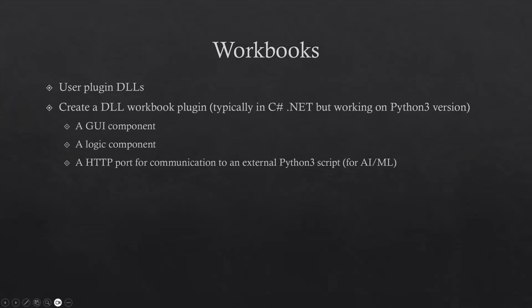The previous two approaches are extremely powerful, but they are largely headless, meaning it can be difficult for a human operator to visualize the state of the AI application and track its progress. They provide the communication and control layer, but not necessarily a rich graphical interface for the AI application itself. This is where AI/ML workbooks come in.